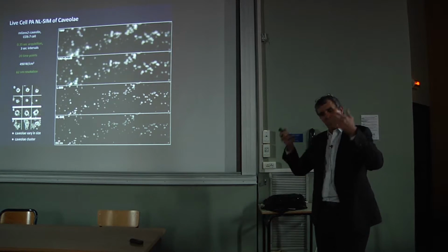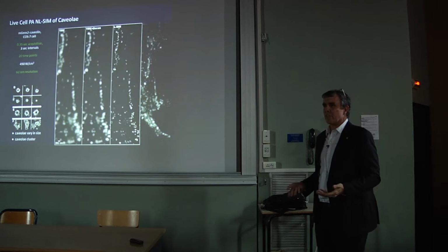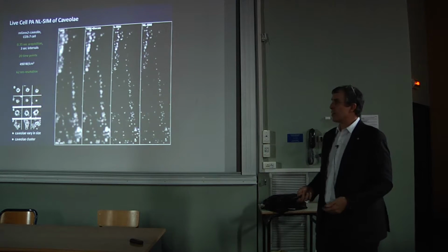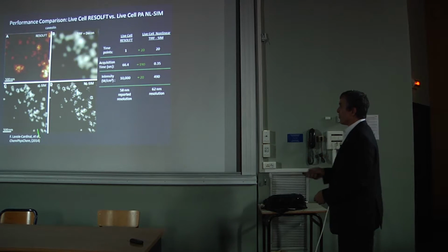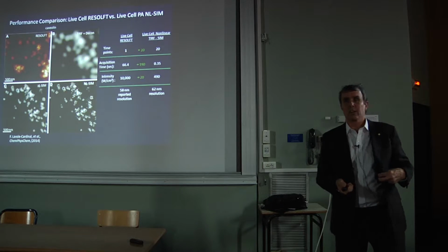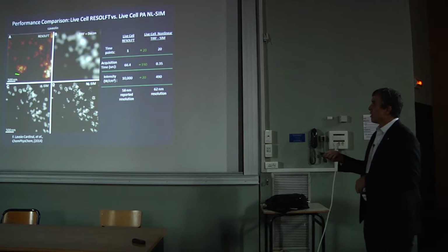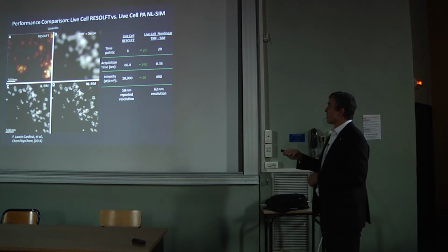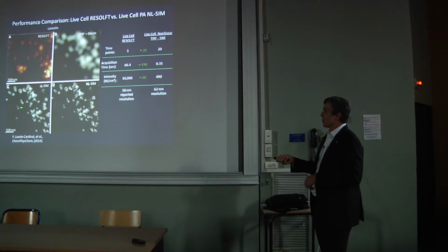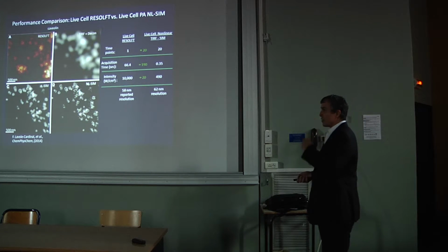that when you look at an EM image, it's just black and white. You don't know what protein is where. The advantage of fluorescence is you have that protein-specific contrast, and we know where all the caveolin is. So one final comparison then is we can compare that to the RESOLFT technique I've been mentioning that Stefan Hell developed, because he had a paper last year where he looked at caveolae. So here's the image of caveolae there. Here's the diffraction limited image that we get. Here's the linear SIM, which is clearly better already, even at the 100 nanometer level. And then here's what we get with the nonlinear SIM.